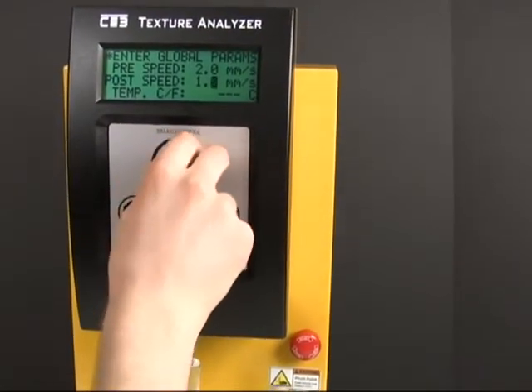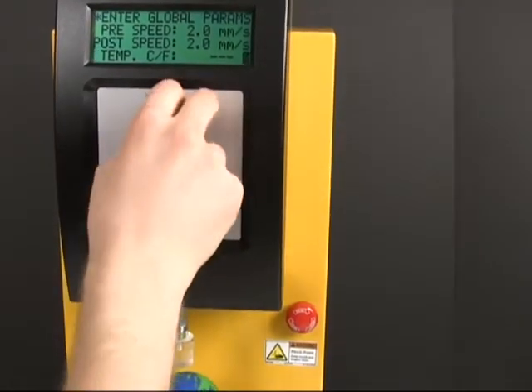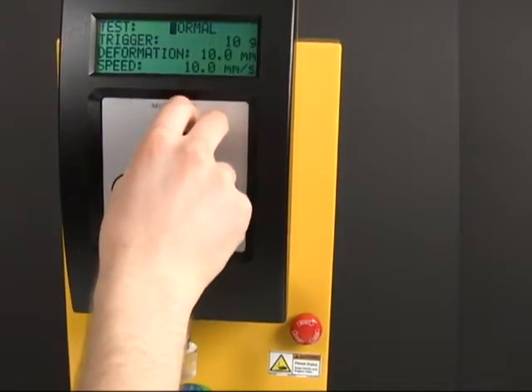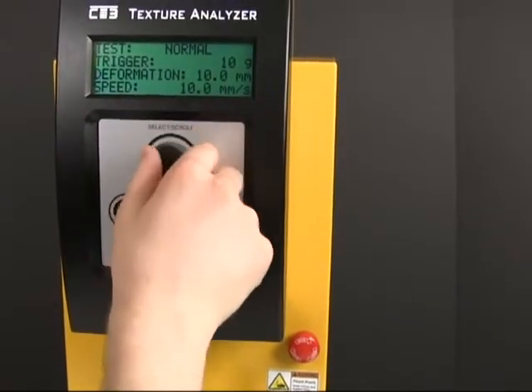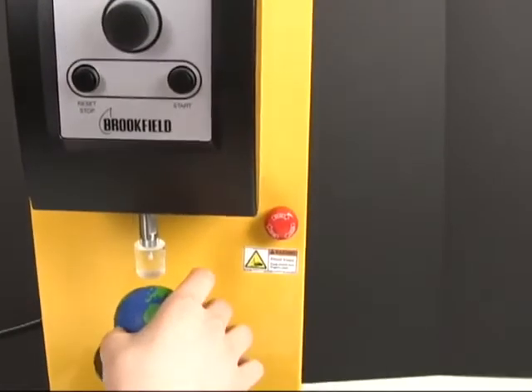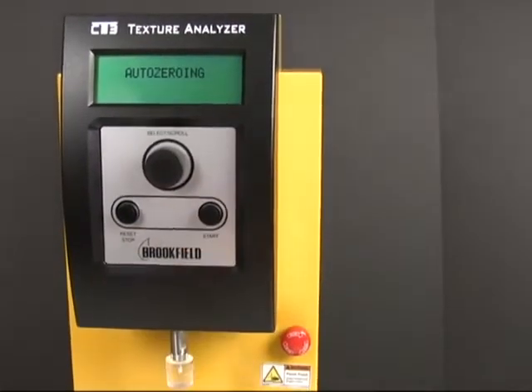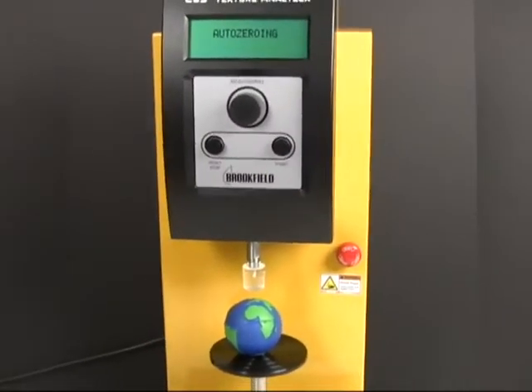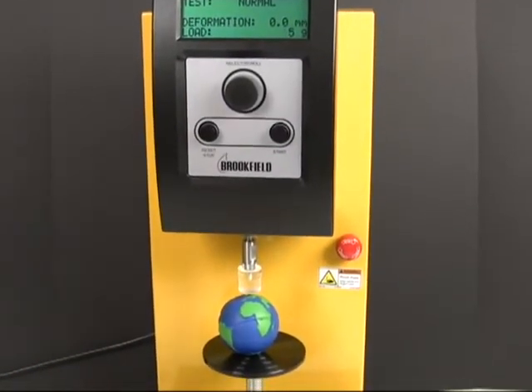I'm just going to crank up the pre-speed and post-speed — it's going to save my operator some time running these tests. Same tests — remember, don't change them and always write them down. I'm going to run this test again. I haven't moved my probe. It does this little auto-zero again. I'm telling you, if time is your main concern, this isn't a great choice.